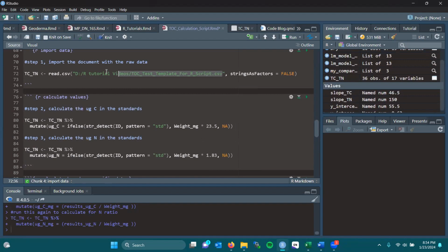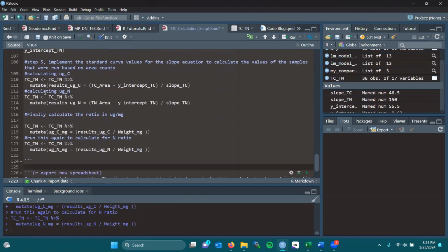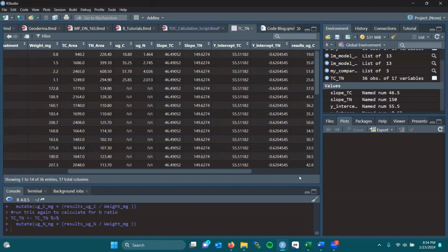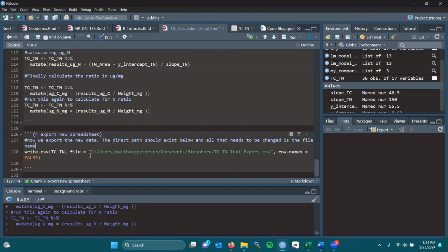All you have to do is change the input line, run the calculation as such, creates all these extra formulas, it gives you your results in order, and then the only other option you need to do is create the new file to export it.